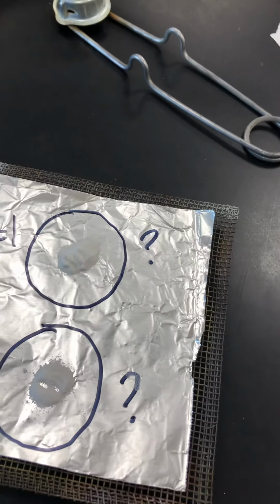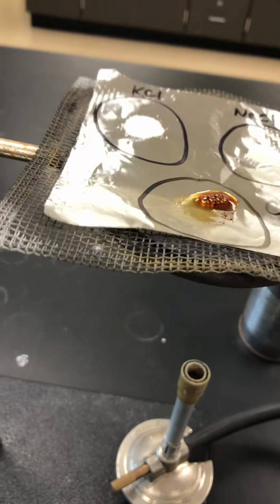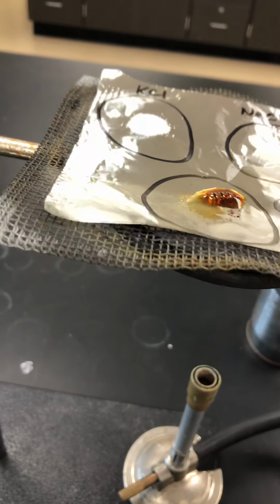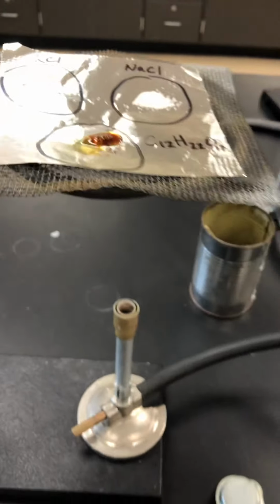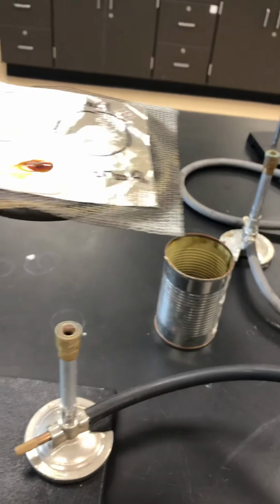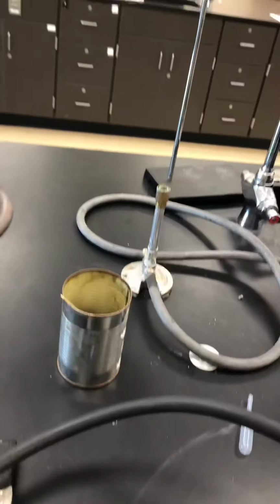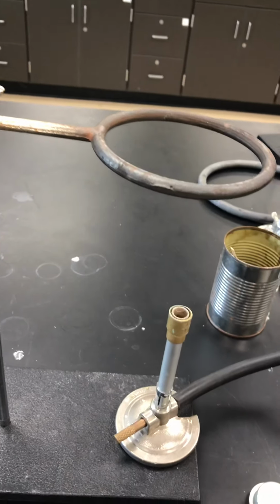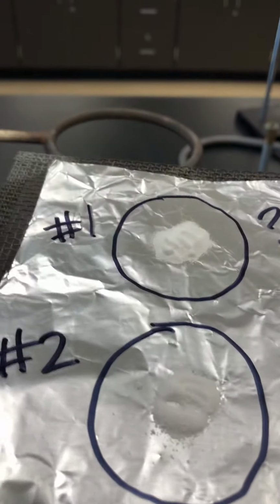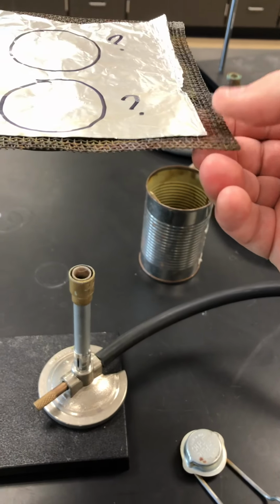Now I need to do the next one. So give me a second while I move this off here. So next are my two unknowns. This is unknown 1 and unknown 2. I'm gonna do the same test to see what results I get.